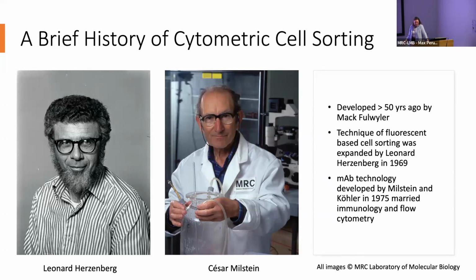And so now scientists have the ability to tag antibodies with a fluorescent dye and then label and fractionate these very specific cell populations of interest for all kinds of things, downstream genetic testing, transplantation, and now it's just so widely used.